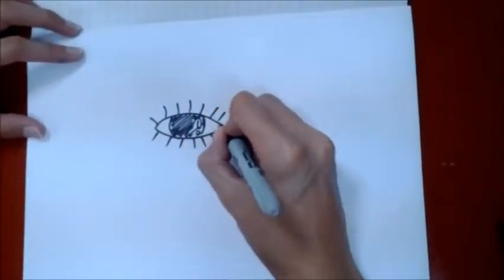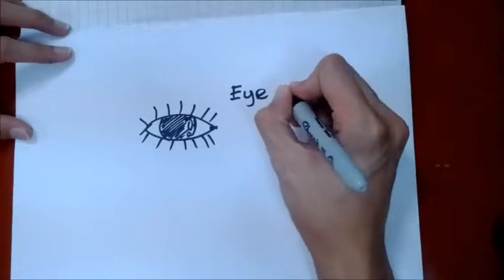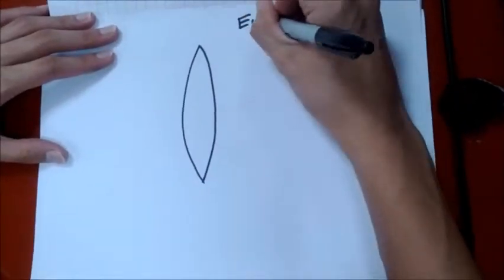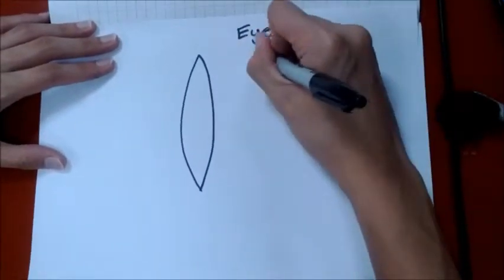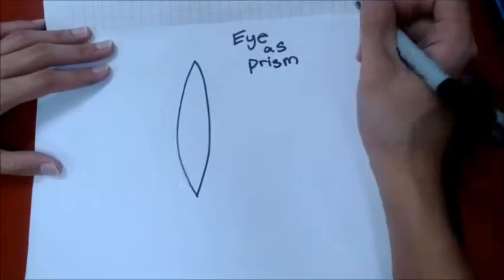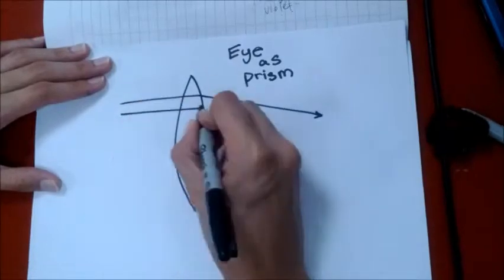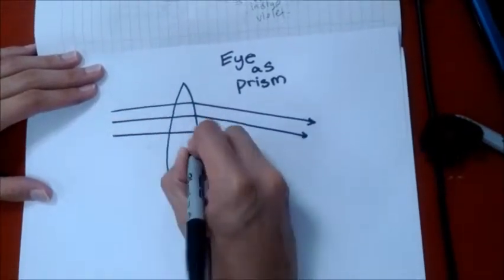The human eye functions as a spectrometer, analyzing the light reflected from the surface of a solid or passing through a liquid. Although we see sunlight, or white light, as uniform or homogeneous in color, it is actually composed of a broad range of radiation wavelengths in the ultraviolet, visible, and infrared portions of the spectrum.